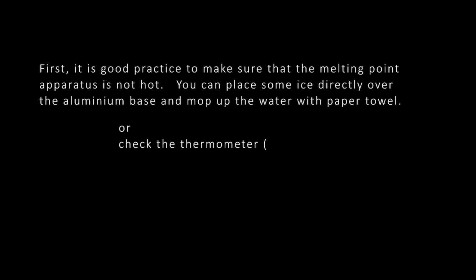First, it is good practice to make sure that the melting point apparatus is not hot. You can place some ice directly over the aluminum base and mop up the water with a paper towel, or check the thermometer so that it's around 20 to 25 degrees Celsius.